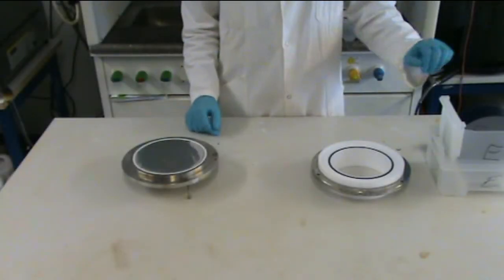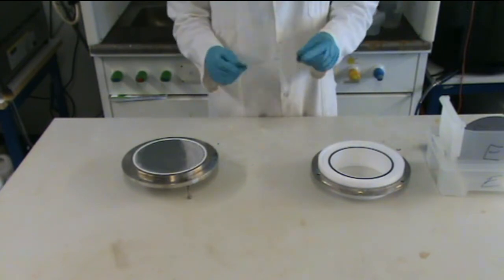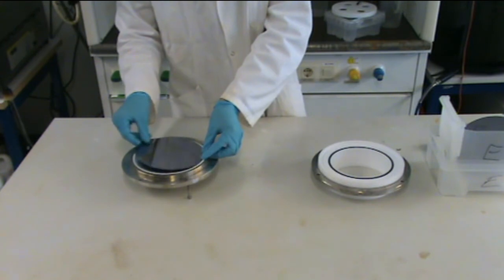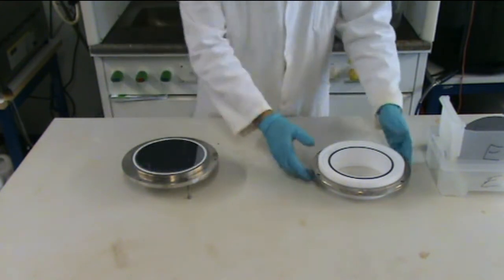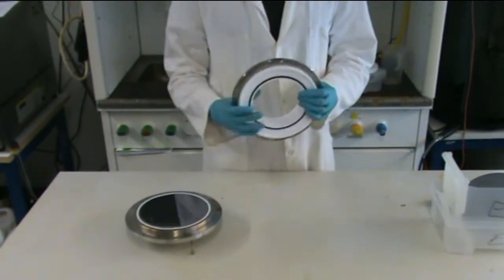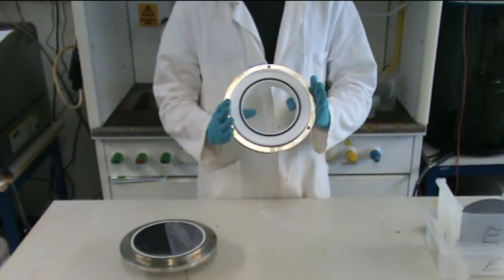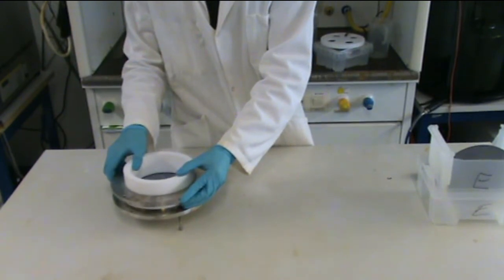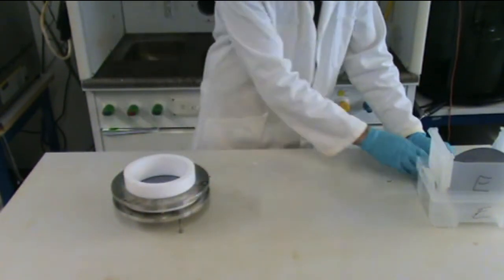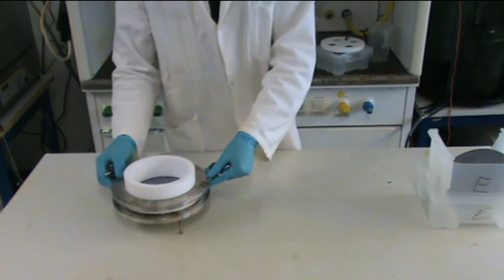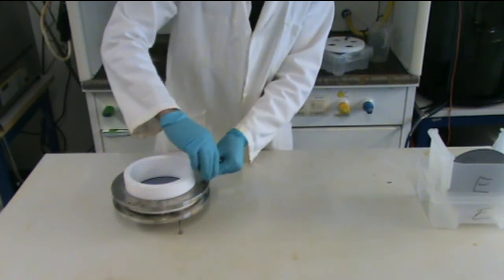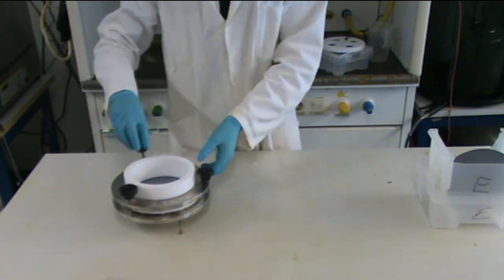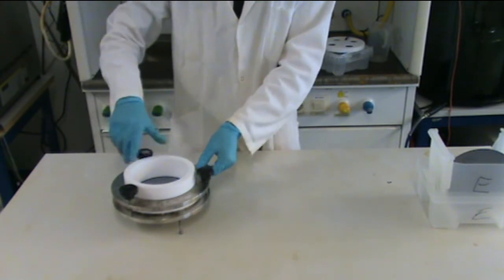To assemble the etching cell I will place the silicon wafer on the metallic contact. Then I will place the teflon tube with o-ring on the top of the silicon wafer. And finally, I will tighten the cell with screws to seal up the etching cell.